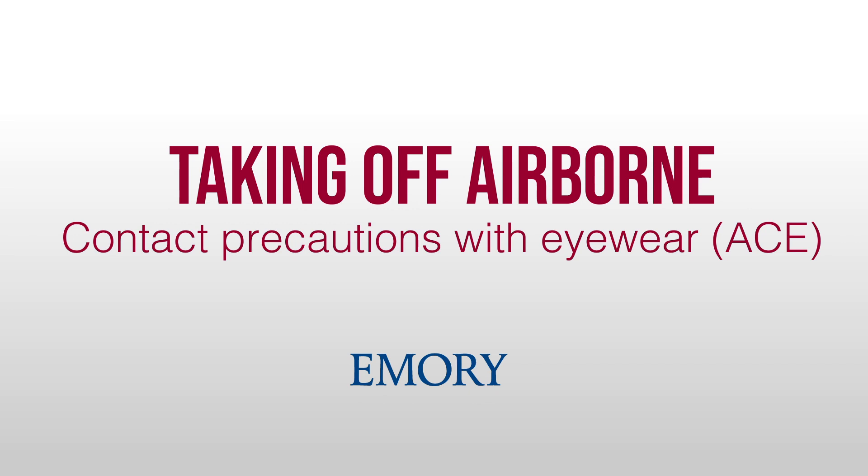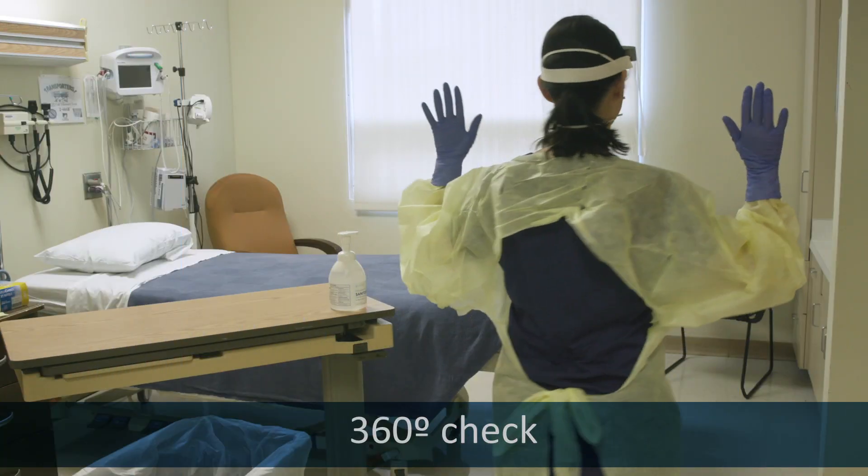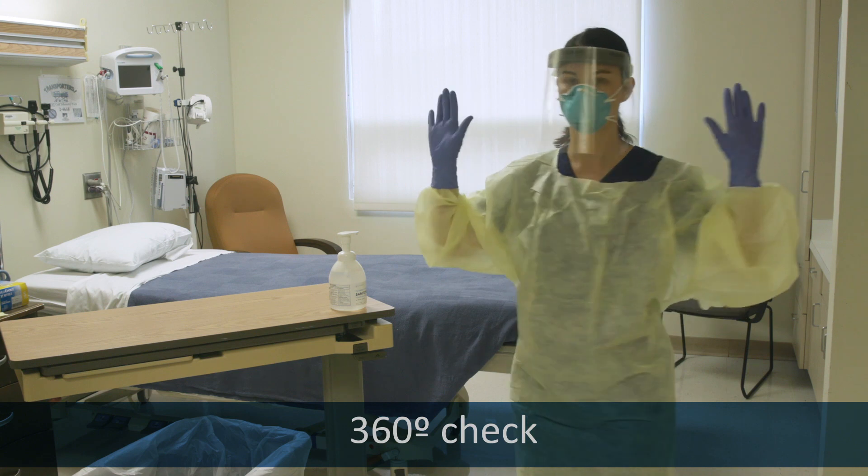Taking off airborne contact precautions with eyewear, inside the patient room. It helps to have a buddy do a 360 visual inspection if they can see you through the patient door.